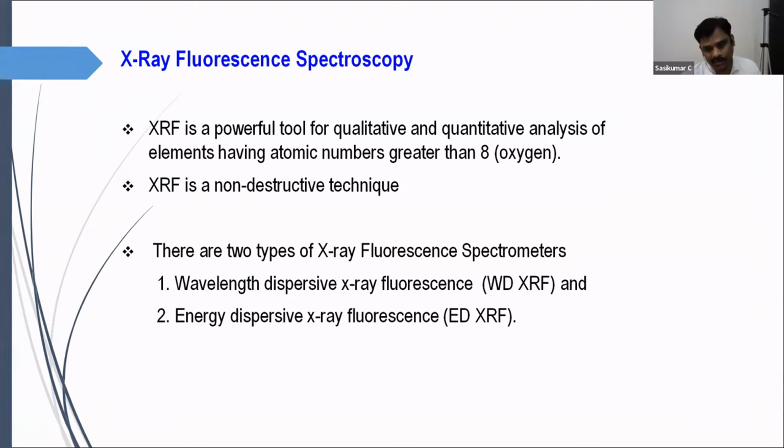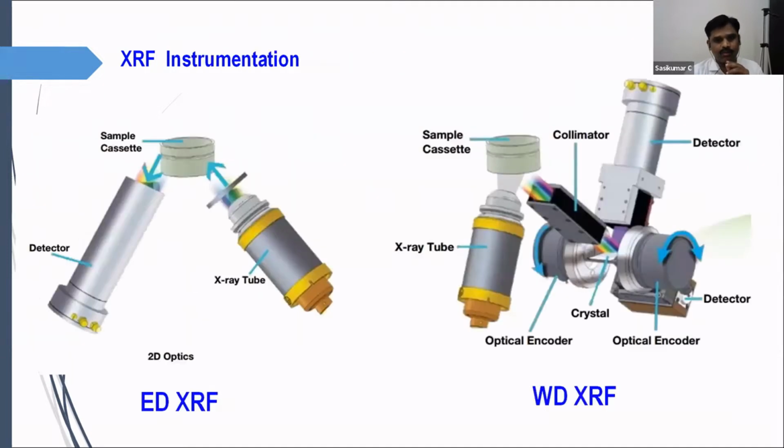There are some typical cases where the resolution will be challenging for a researcher. In that case, you need to go for WD XRF. You can resolve the peak very clearly if you are using WD XRF. Accordingly, the cost of equipment is also different. ED XRF and WD XRF are going to be different cost-wise also.